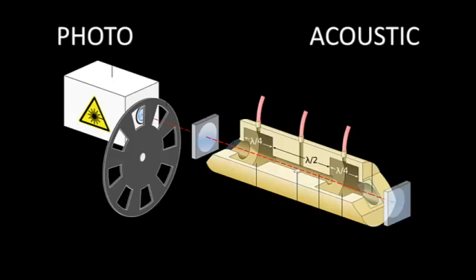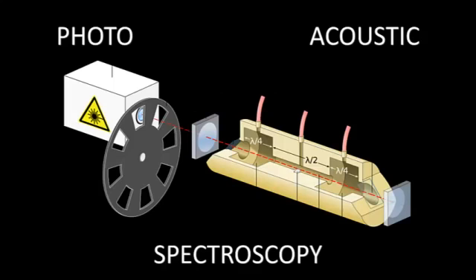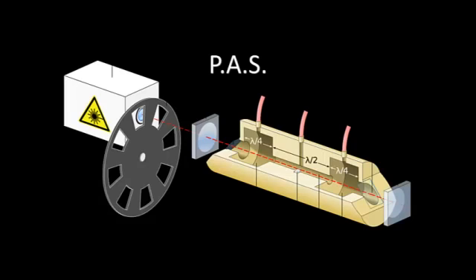By choosing this video, you have opened your mind to learn about the instrumental technique called photoacoustic spectroscopy. As the name sounds, photoacoustic spectroscopy deals with two types of energies in the forms of waves, both light and sound. You might ask yourself, how exactly does this work? Absorbance spectra cannot be obtained from two different types of energies at the same time. If you ask that question, you are on the correct path to understanding how a photoacoustic spectrometer, or PAS, works.